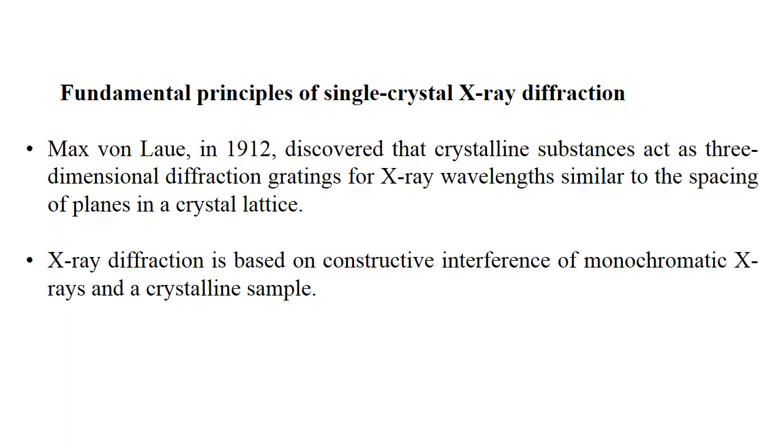X-ray diffraction is now a common technique for the study of crystal structures and atomic spacing. It is based on constructive interference of monochromatic X-rays and a crystalline sample.